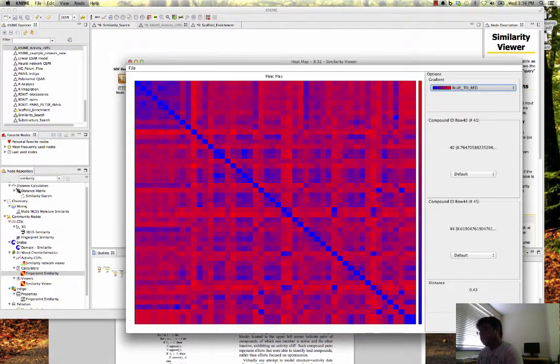So remember, when you put the distance matrix, it's 1 minus similarity. So these you can see are all 0, and this is like 0.1. This has a very high distance, so it means it is less similar, and this one has a very small value, so it is very highly similar.